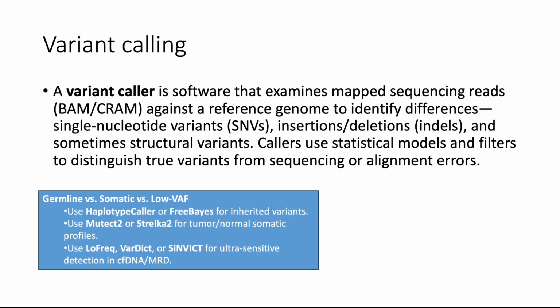Next stage is variant calling. We're using software that examines mapped sequence reads against a reference genome to identify differences: single nucleotide variants, insertions, deletions, and structural variants.